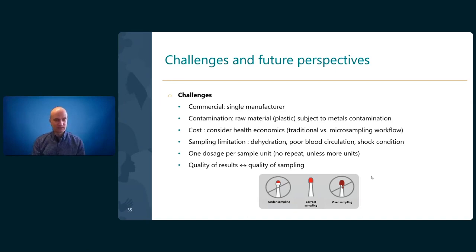Finally, it's worth mentioning that the quality of the results will strongly depend on the quality of the sampling. And this is true for all types of sampling, obviously, but especially here with VAMS devices. So you have to make sure that you do a correct sampling.